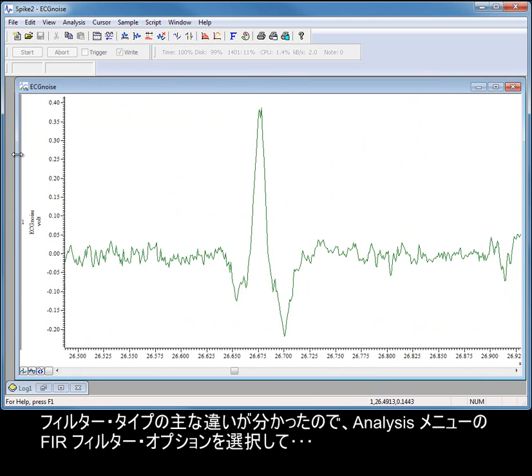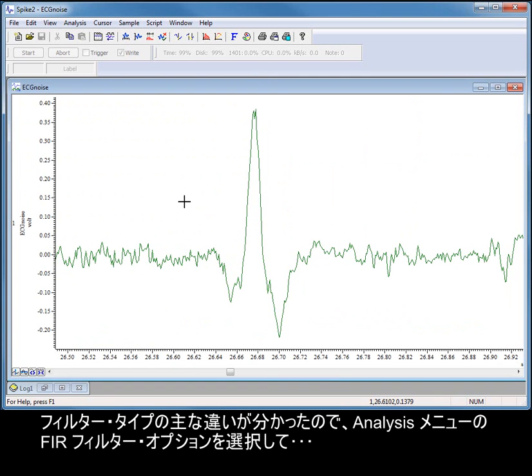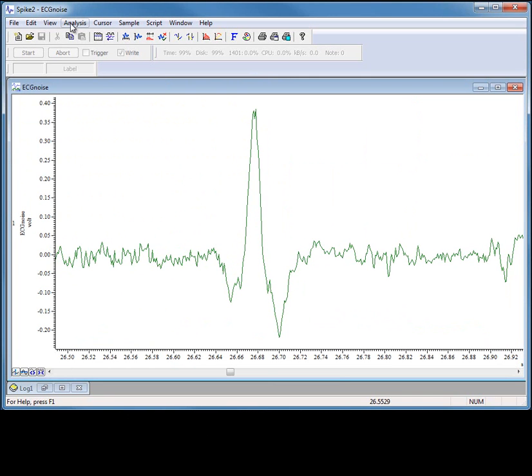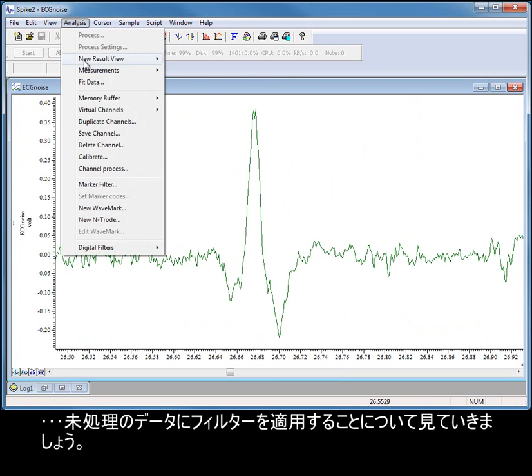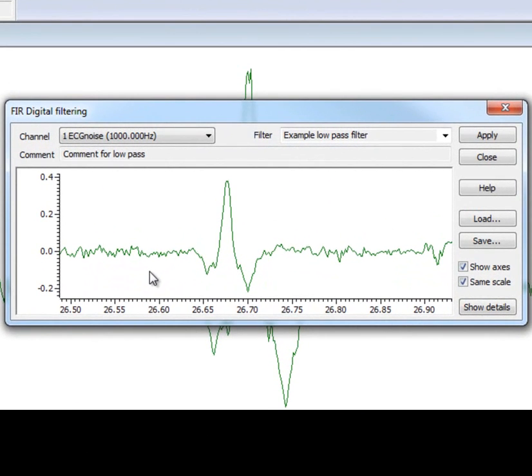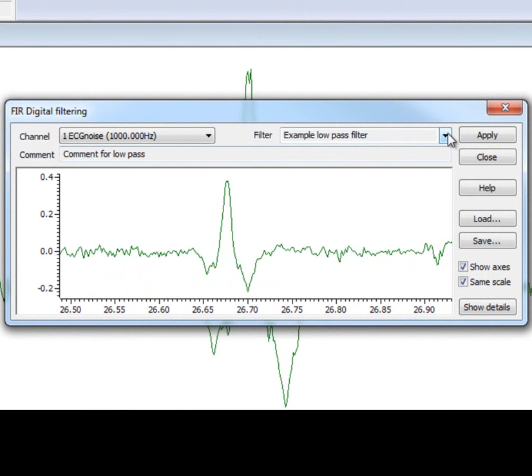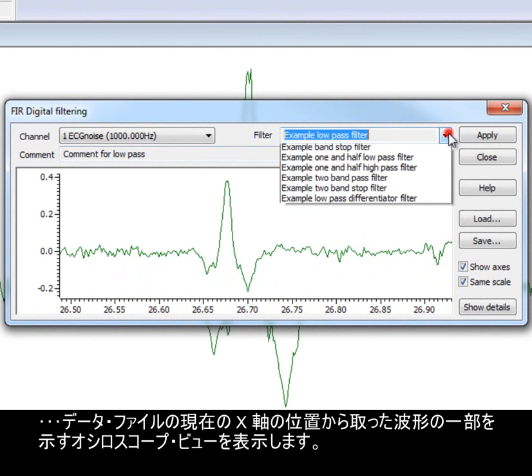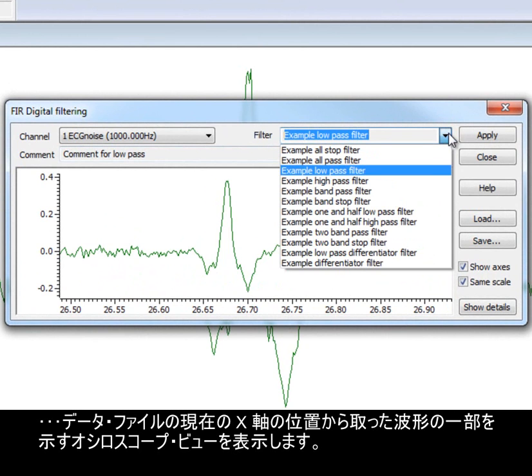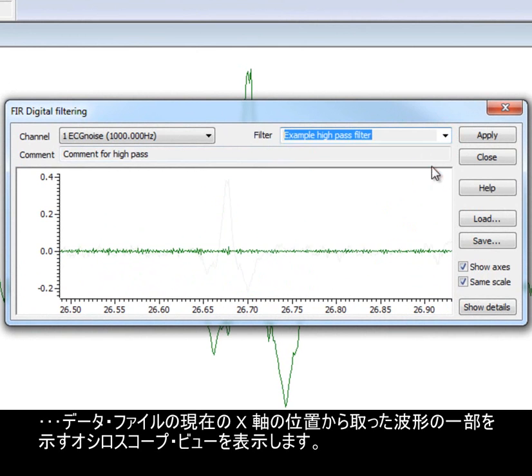Now that we have seen the main differences between the filter types, let's look at applying filters to our raw data by selecting the FIR filter option from the analysis menu. The filter dialogue displays an oscilloscope view showing a section of the waveform taken from the current x-axis position of the data file, along with the drop-down list that holds a filter bank of examples that can be applied to the data.